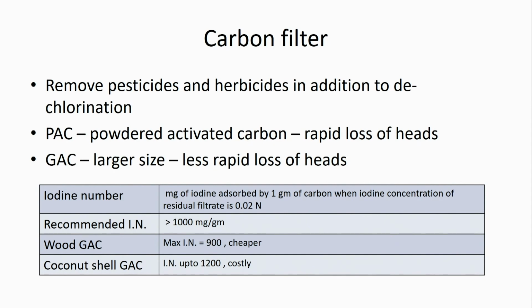And the second thing is deionizers. Deionizers are fantastic with one reservation. When we are talking about purity from deionizers, it is mineralogical purity. Deionizer resins have been said to be a good medium for bacteria. Now, we have never in 17 years had bacterial growth from our deionizer, because we use 10 normal hydrochloric acid and 10 normal sodium hydroxide twice a week to regenerate it. If you can do that, the 10 normal hydrochloric acid will dissolve anything, and 10 normal sodium hydroxide will dissolve anything. No bacteria, no virus, nothing is going to survive it. But if you forget to do that, you will 100% have a growth of bacteria in the deionizer.